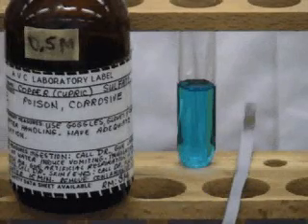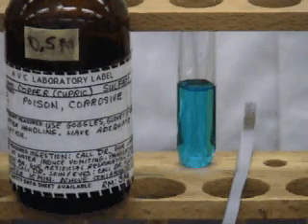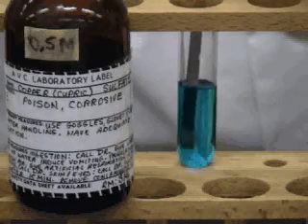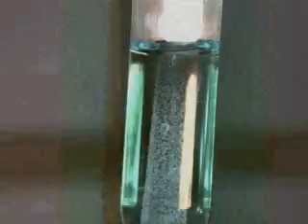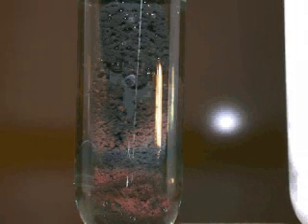Here we have a strip of zinc and a solution of copper 2 sulfate. Record your initial observations. We will now place the zinc into the solution. This represents zinc and copper sulfate solution after a few minutes. Record your observations.